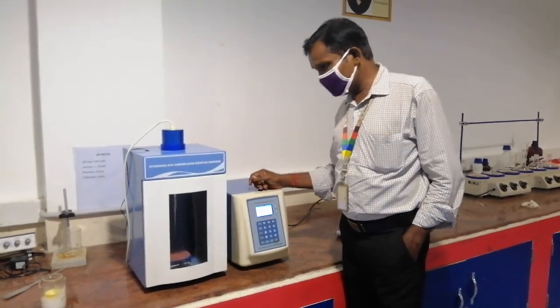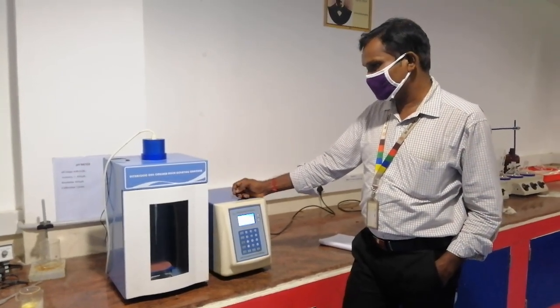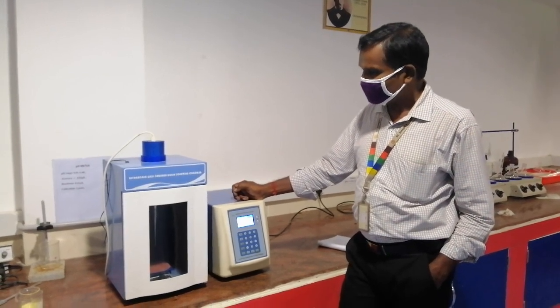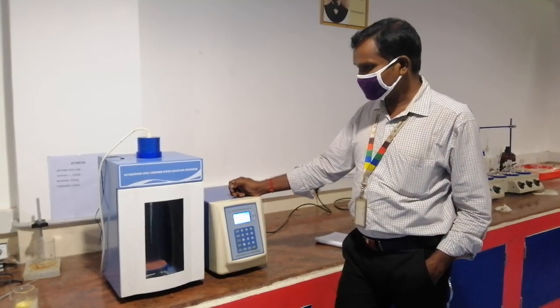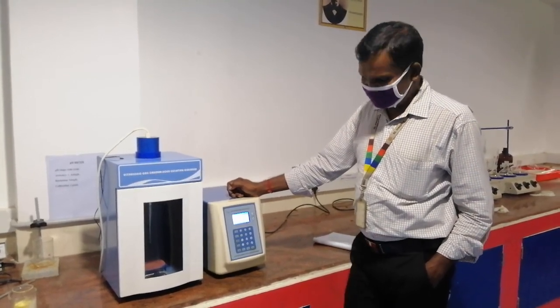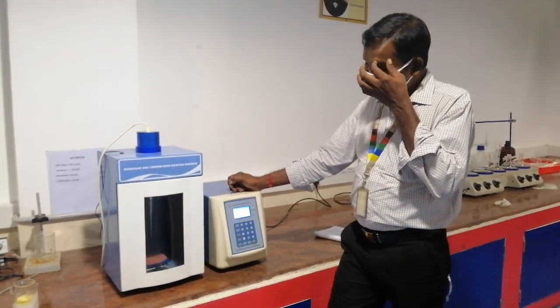For which you have to take 20 microliter of sample. This is a filtrate sample. Mix this 20 microliter of sample with 2 ml of Bradford reagent and incubate at 37 degrees Celsius. And then take the OD at 595 nanometer. So you will get the OD for your samples.